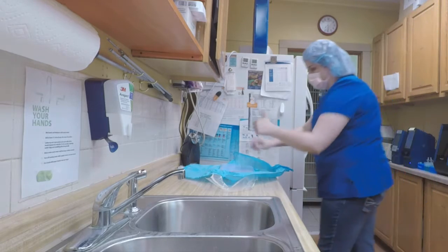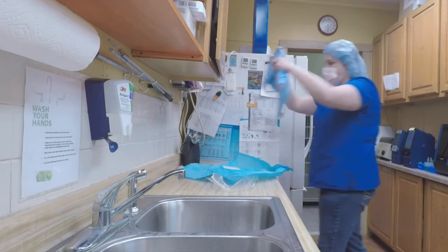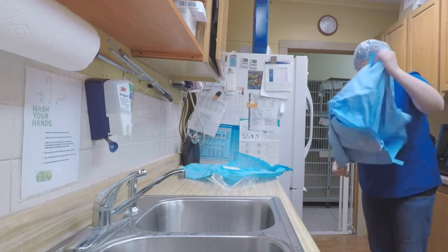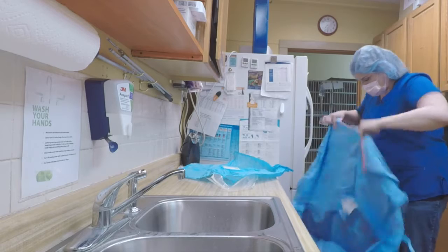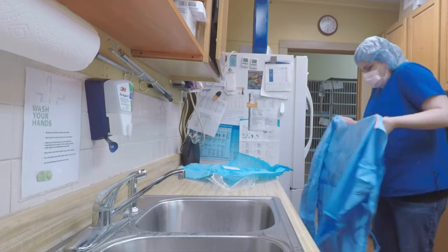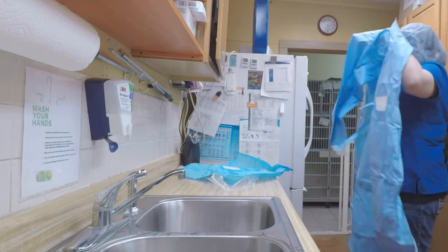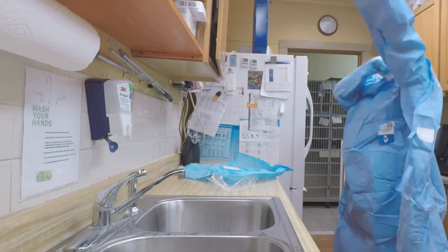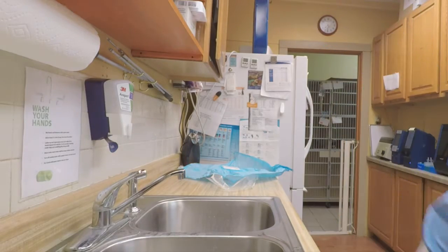And then you will want to open up your gown. You'll slide both arms in, and do not go all the way through the sleeves. Wait, I'm in.